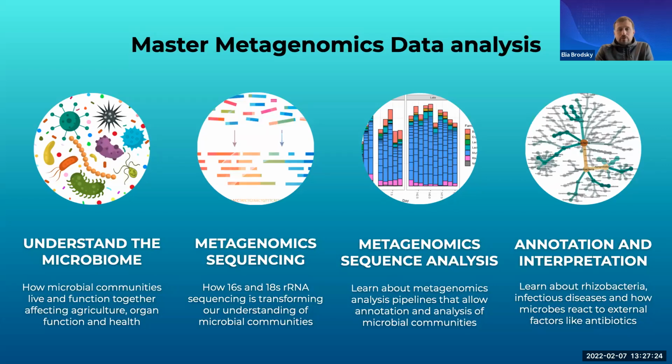That is one of the objectives of this kind of analysis, to be able to interpret what is going on. That heavily relies on our ability to annotate the different elements that we can find. And here the limiting factor is that there are many more microorganisms, and a lot of variation within them, than what has been annotated. Obviously this annotation continues as an effort into characterization of the different microorganisms.